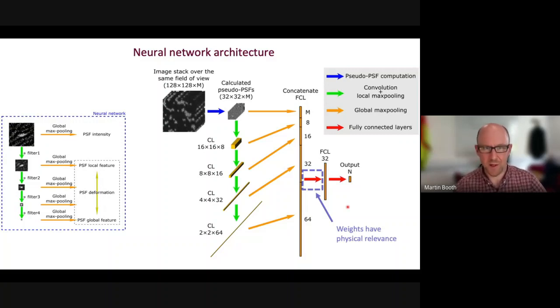This is very unusual. Normally, neural network architectures are black boxes. You don't look inside them, you just hope that the answer comes out correctly. Right, this still needs training. You can design this architecture and think this looks logical, but it still needs training, and the training data is very important as well here. So let me just briefly explain that.